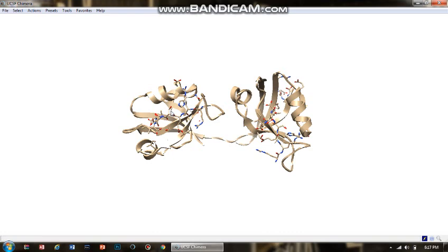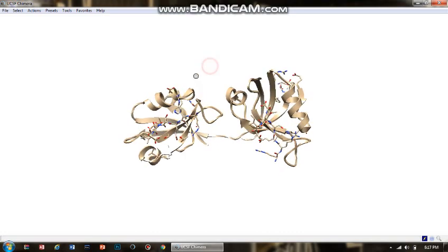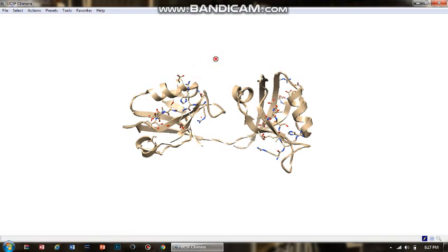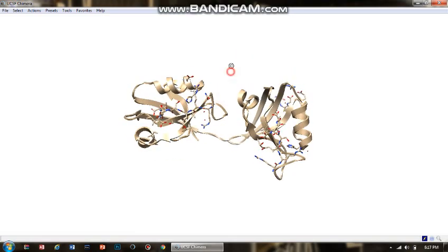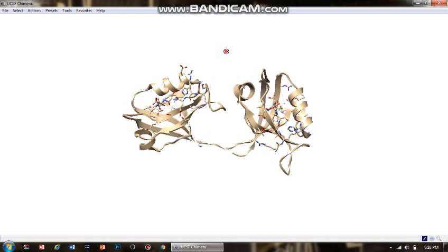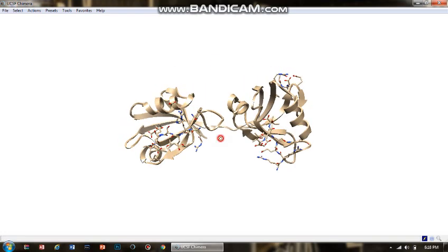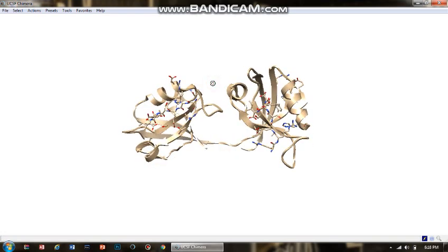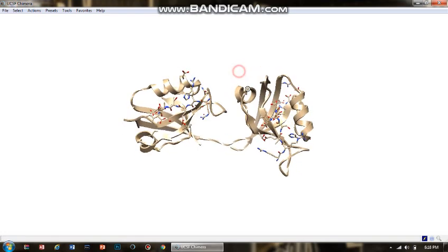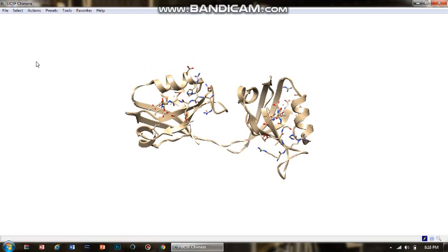Why do we need three different representations to view a protein molecule? When working on the software to generate a 3D diagram, we want different angles and aspects of the image to differentiate between different representations or conformations. We want to analyze the protein from every different angle.